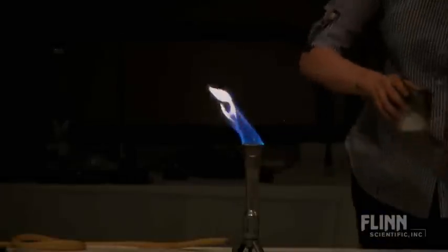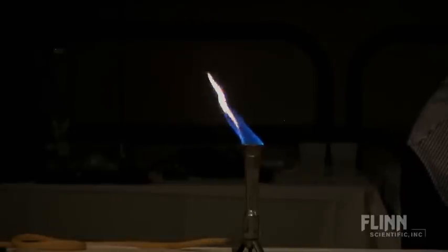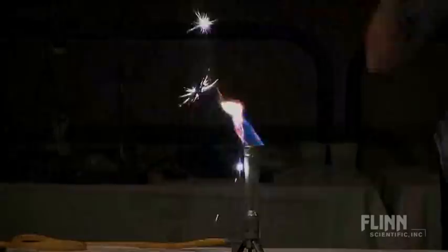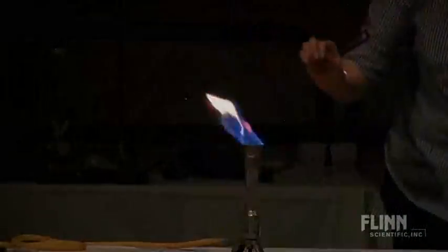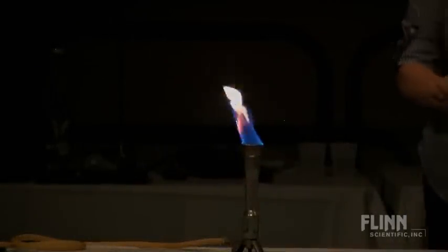But if you want something brighter, you go for some titanium. Here's some titanium — way cooler! A little powdered titanium.